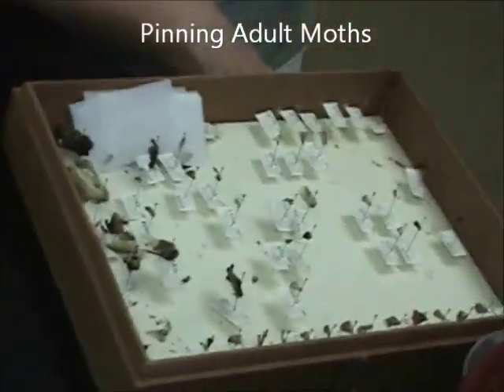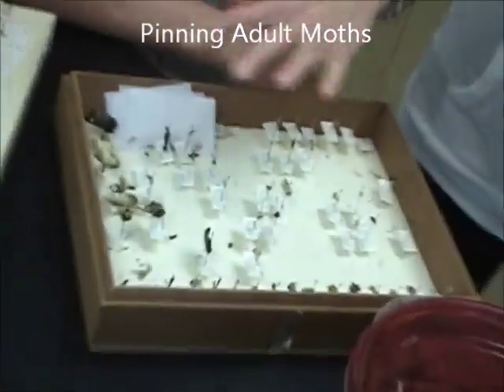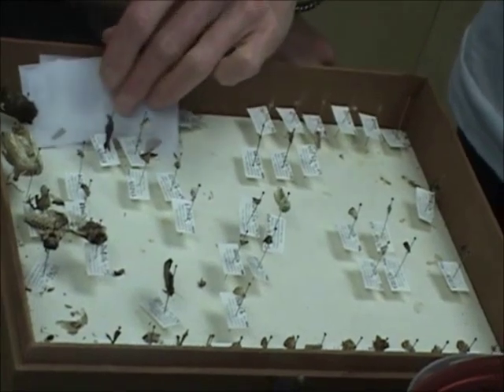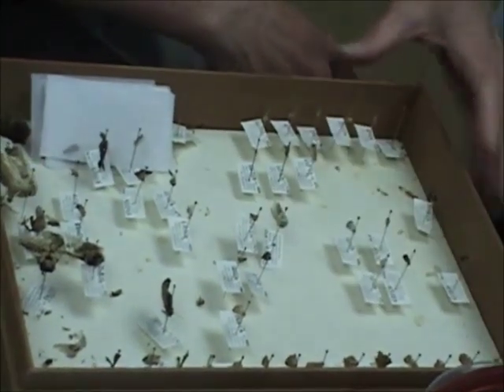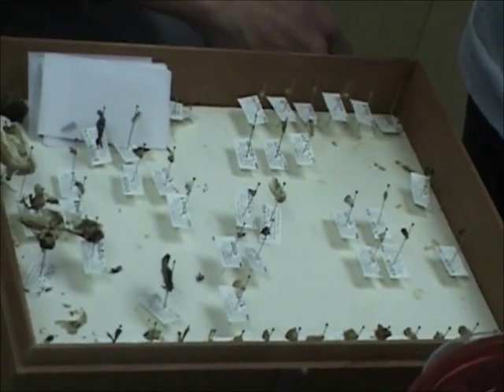This is an example of a box that came back. These guys were fairly destroyed — things had come unpinned and were rolling around in here, so you can see all the parts: wings and everything. A few of them are still intact, but some you just have like, oh, here's a head, here's a thorax, something else attached to it.